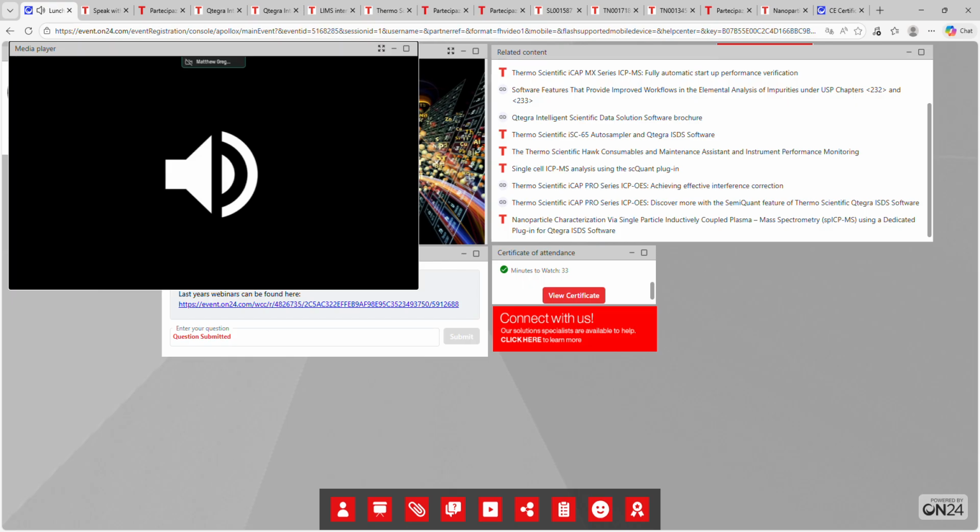Or it could be the presence of that internal standard in your sample. So if you're using yttrium, for example, as an internal standard, but your sample has loads of yttrium in it, then it's obviously going to give you a really big false positive. There's usually a reason behind it. So I think they're probably the most likely reasons: there's some sort of interference going on, or there's nothing in the blank and it's giving a false positive like that.